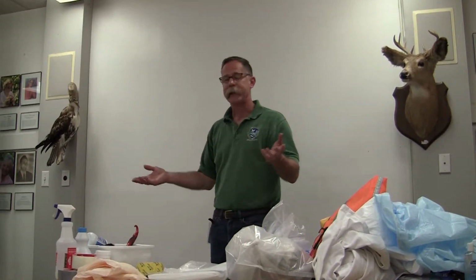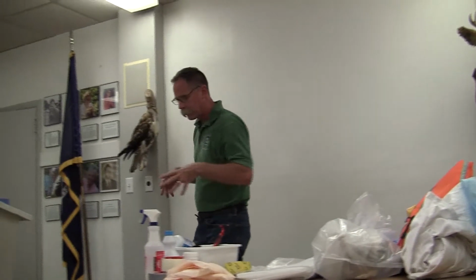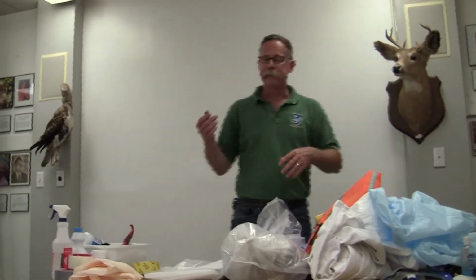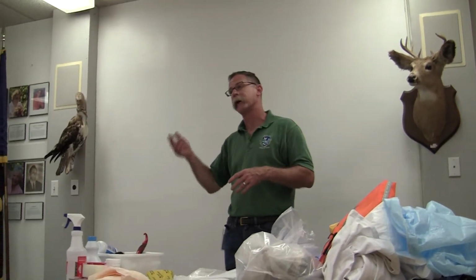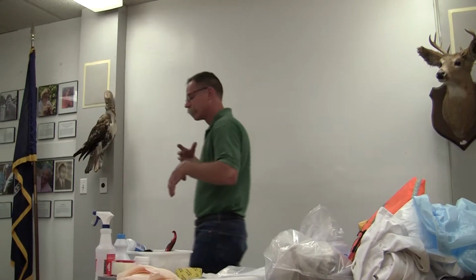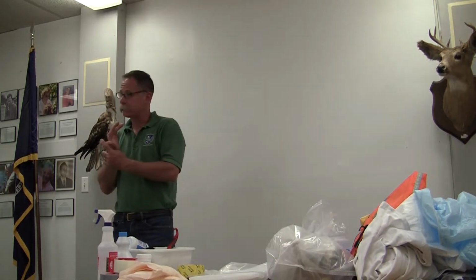Alternatively, use one of those blue mortar mixing bins that we have. They're just like a little deer stretcher, and they contain any fluids that might leak out, so you don't contaminate the truck. What we worry about with deer carcasses, certainly if it's got chronic wasting disease, are the prions that cause chronic wasting disease. We don't want to get them on anything, on the trucks or anything, because it's very difficult to inactivate those.